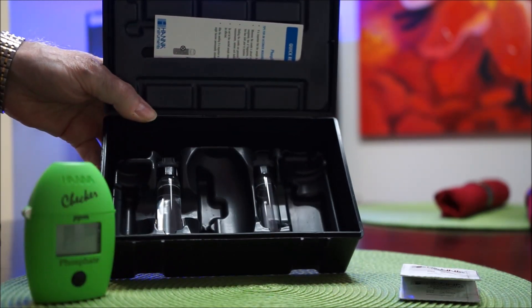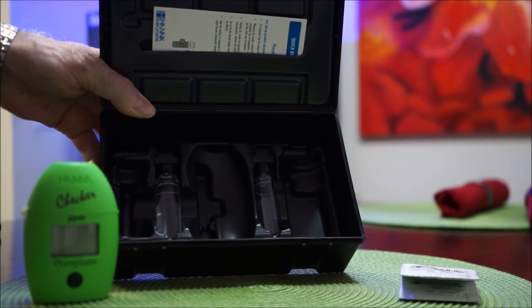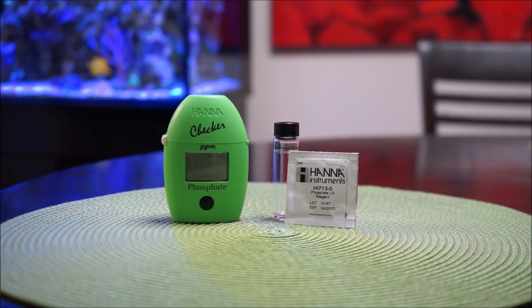Now I'm going to demonstrate the actual test. Going from left to right, you have the Hanna Checker low range for phosphates, then you have the vial, and then you have the test powder. What we're going to do now is go to the tank, get some water, and I'll walk you through the steps.